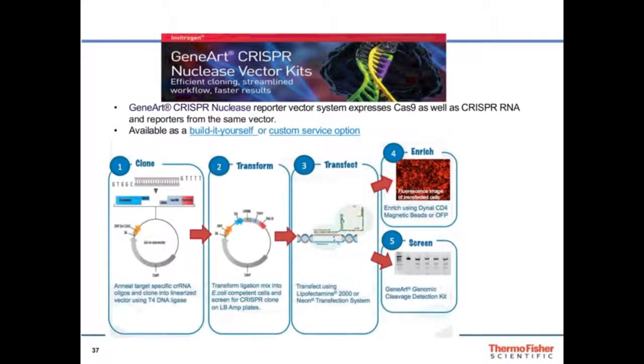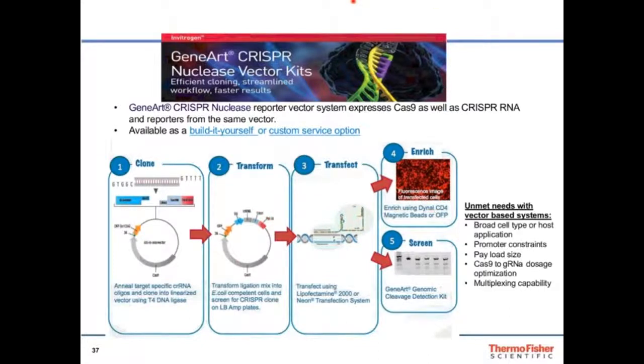So basically, we did launch vectors, and like I said, we had two versions, one with the fluorescent protein tag and one with the membrane tag. They're very useful, and I think they're doing very well in the field. But we found that they do still have some drawbacks.